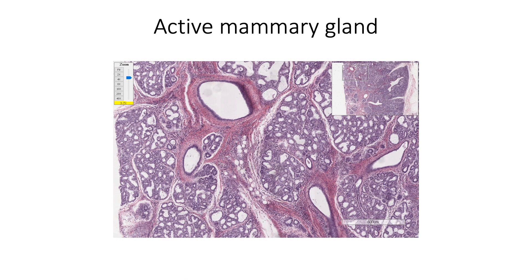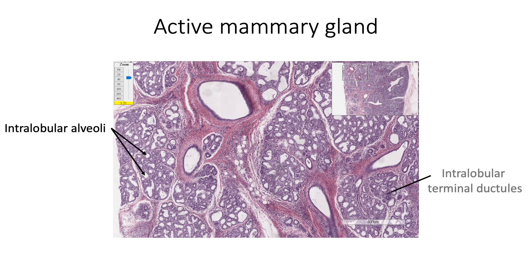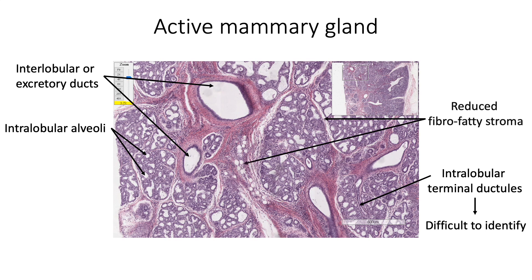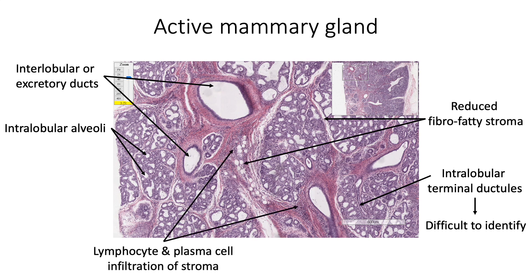In the active mammary gland, the terminal duct lobular unit predominantly contains intralobular alveoli. We can also see intralobular terminal ductules, but they are difficult to distinguish from the alveoli because their lining epithelium almost resembles that of alveoli. In addition, we also see interlobular or excretory ducts in the reduced fibro-fatty stroma, which shows infiltration by lymphocytes and plasma cells.